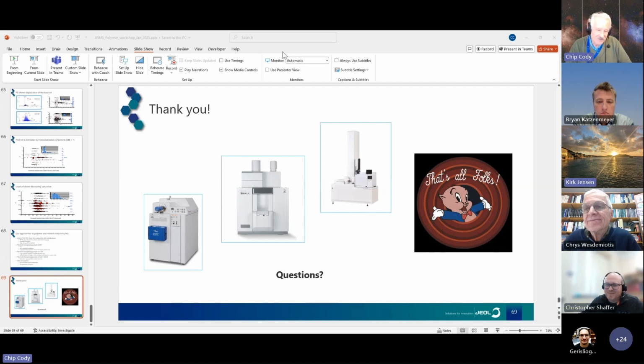Thank you. Thanks. Just to add some context to what I was expecting out of the pump oil: somebody had dropped off that pump oil in our lab, and I noticed that it had only been in use for a short time. Pump oils, we typically change out maybe 6 to 8 months is our recommended maintenance period. And this was like a few weeks. Very odd to pull out this gunky looking sample in just a few weeks. So I was just curious what the difference looked like.